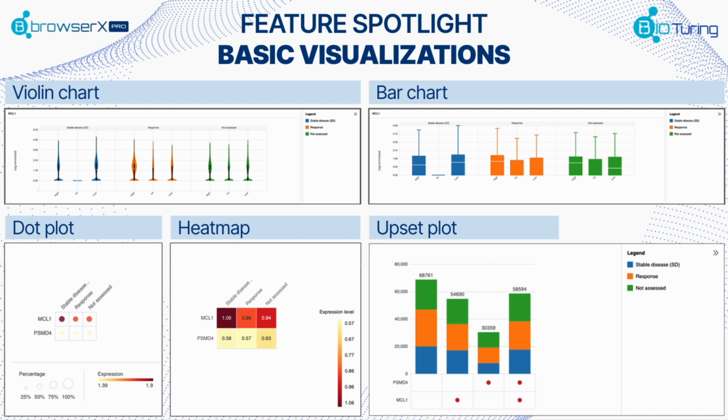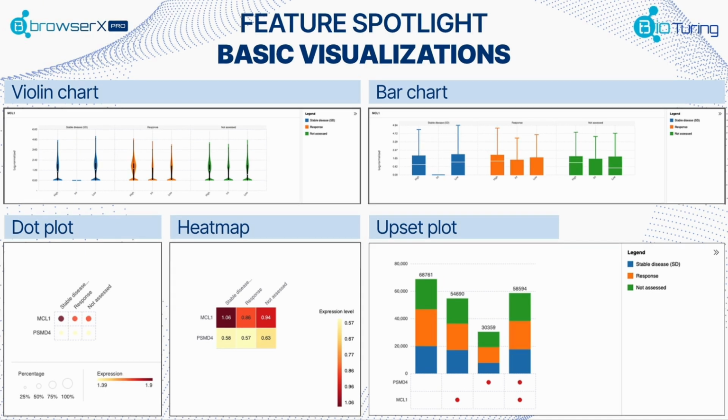Additionally, the platform provides a suite of basic visualization tools for you to examine the gene expression across different populations of cells. You can build violin charts, bar charts, dot plots, heat maps, and upset plots, to name a few.